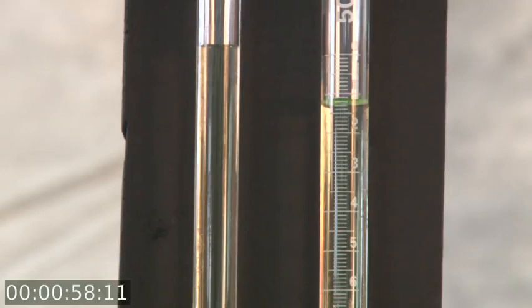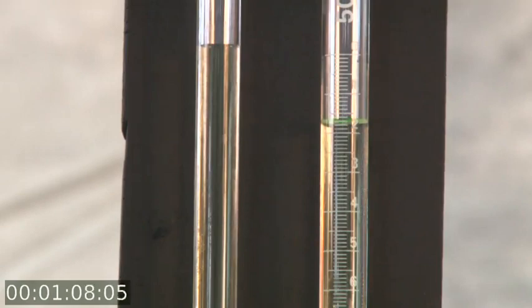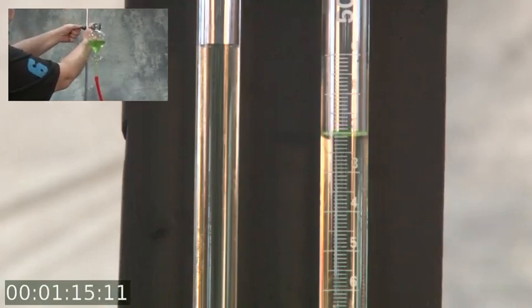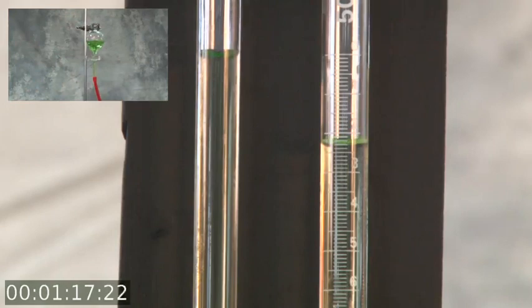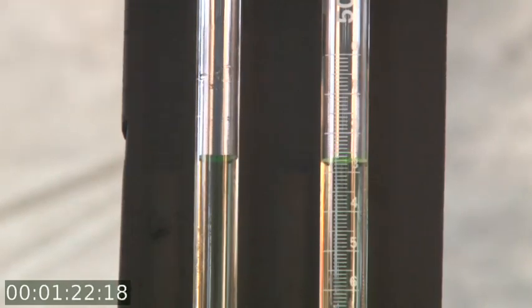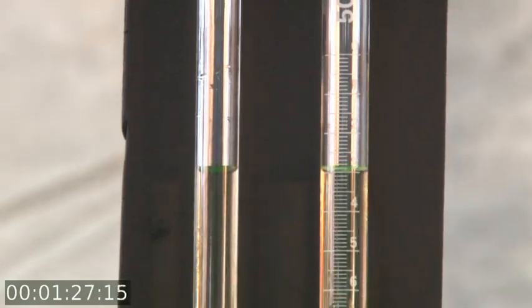We continue to look at the clock over here, which is ticking, and after about a minute we're going to take our first reading. But before we do our first reading, we need to make sure that we don't have overpressure, so we're going to lower the reservoir over here. That will lower the left hand arm until they get to equal level, and then what you need to do is, when they get to an equal level, take a reading quickly, both of the gas evolved and of the clock. You can rewind the video if you missed the point where these were equal in level.